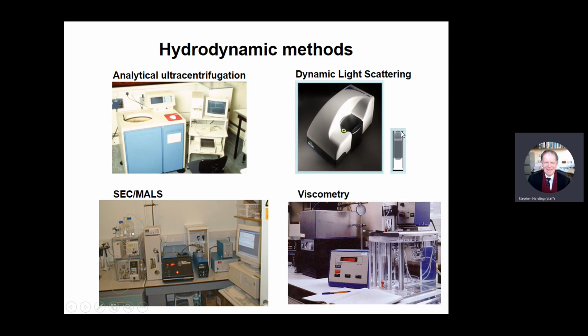And these cuvettes and solutions have to be scrupulously clean because of the problem of stray scattering from any aggregates or dust particles or things that are present.